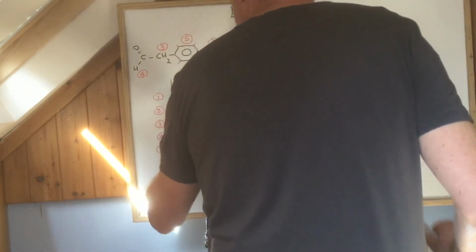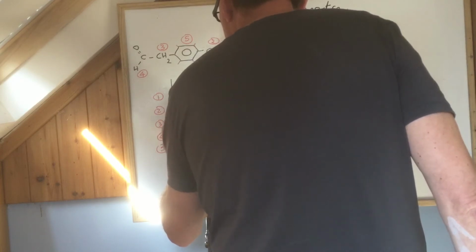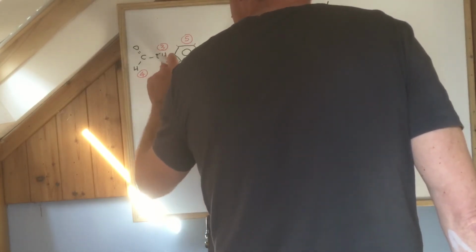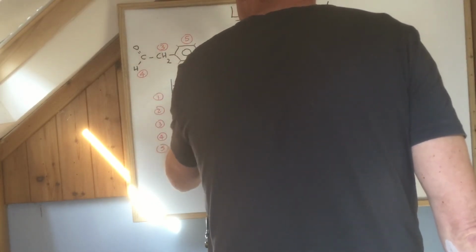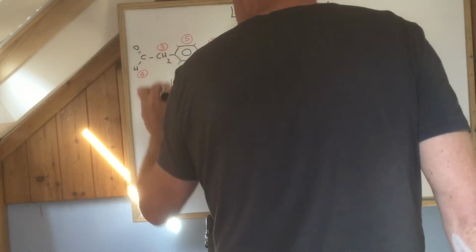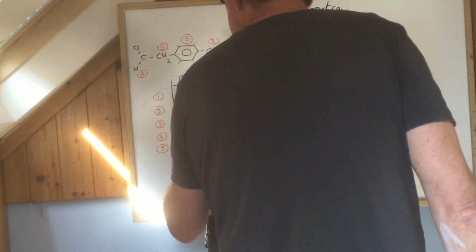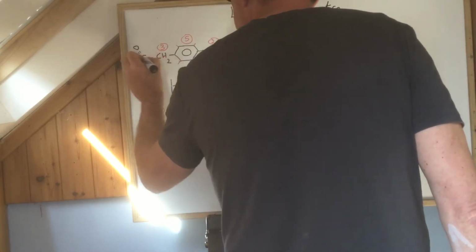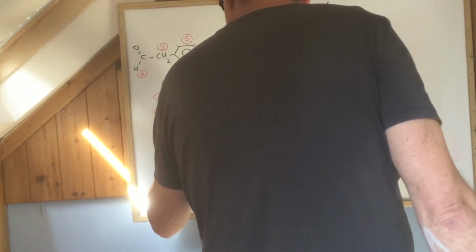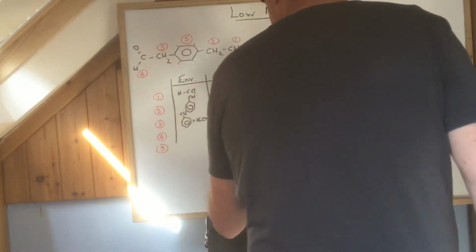Number 3 is a bit weird because it's exactly the same. Monosubstituted, we've got 2 things going on, 2 influences on those. And that means actually, well, we'll discuss that when we look at an A-level question. So we've got that, but they're not identical to those because they're joined to that business there rather than a methyl group over there. But they're still going to be 2 to 3 for that. But we've got another influence on these, okay? Still looking at just these 3 here, plus they have the influence of CH, C, C double bond O on there. So there should be a plus there. 2 different influences. That's 2 to 3 as well, chemical shift. So H, C, C double bond O. Either way, there's 2 in that environment.